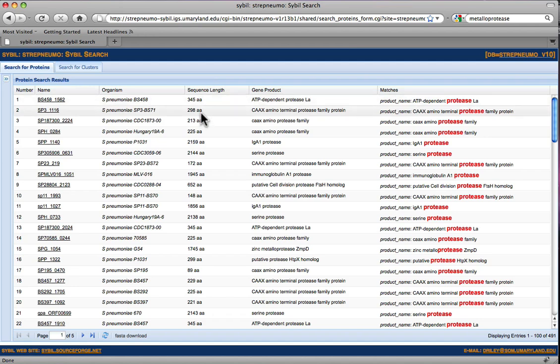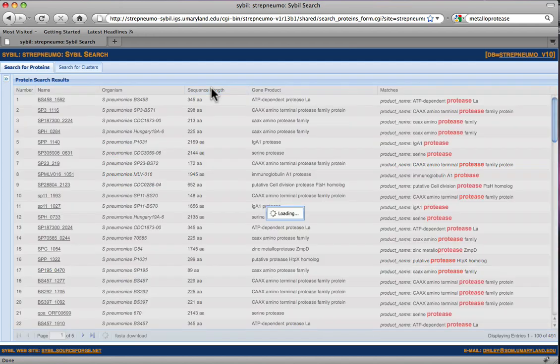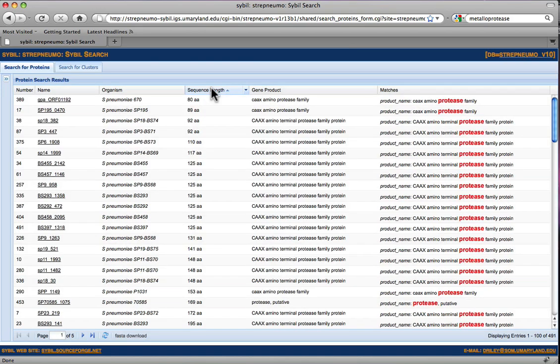Clicking on a column header will sort the results by that column. The arrow next to the term indicates the sort direction. Hovering over a column header reveals a down arrow on the right side of the column. Clicking on the arrow opens a drop-down which allows you to select ascending or descending sort.